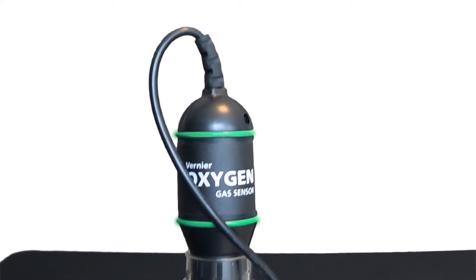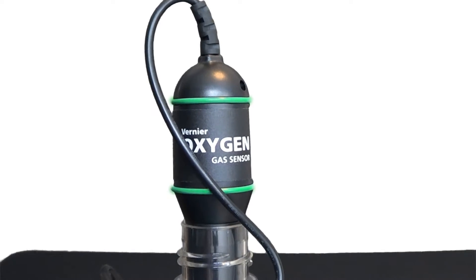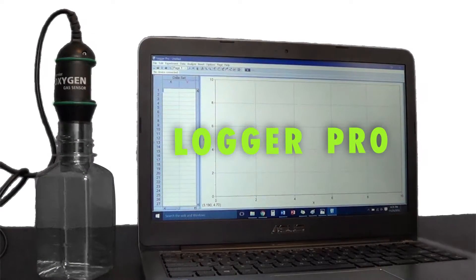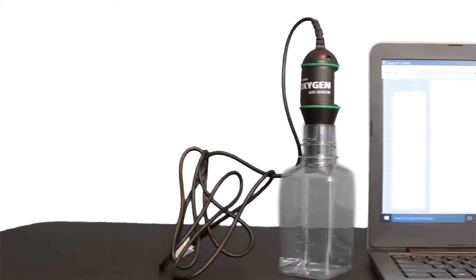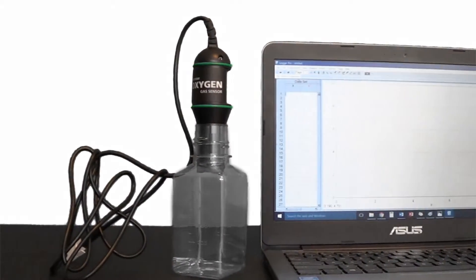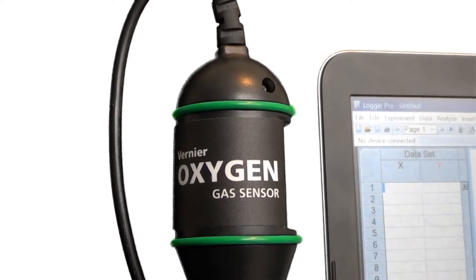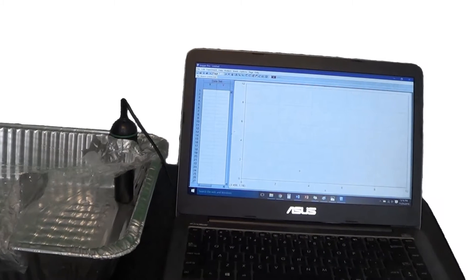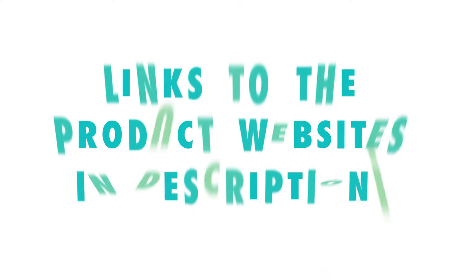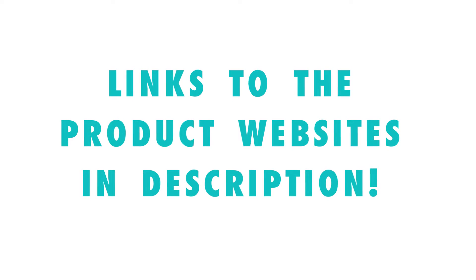In order to record the oxygen levels within the environment, we've used a Vernier O2 gas sensor with GoLink USB sensor interface, Logger Pro software, and a computer. You can use any compatible combination of sensor and software, so long as you have a way of measuring the oxygen concentrations. Your school will more than likely have an instrument available for you to use, because these sensors are expensive. They're typically standard for a biology or chemistry laboratory to have, so just talk to your teachers and figure out where you can borrow one.